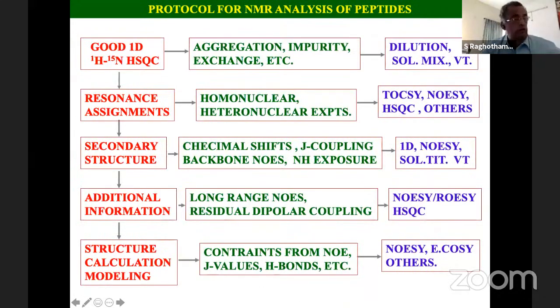So with that, I have covered the basics, two basic NMR experiments, COSY and NOESY. Also I've covered HSQC, a heteronuclear correlation experiment. There are many more experiments one can do: varieties of COSY experiments, varieties of NOESY experiments, varieties of HSQC experiments. And if you go to 3D, there are a lot more experiments we do. Now, if you have these basic experiments, one can go ahead and get the structures.